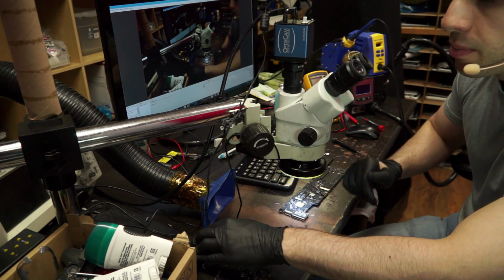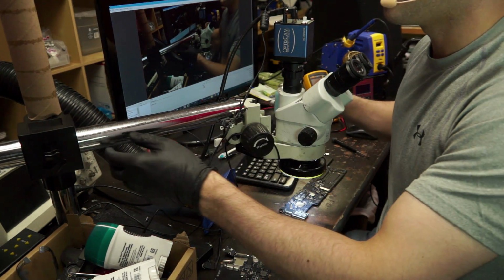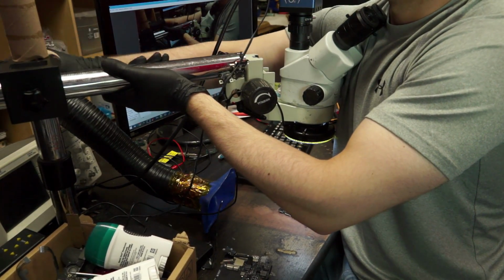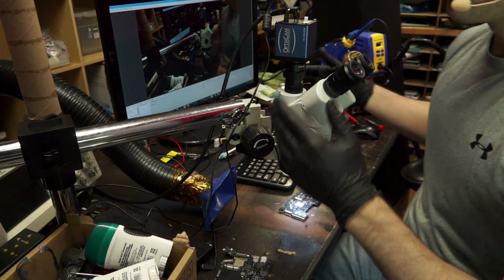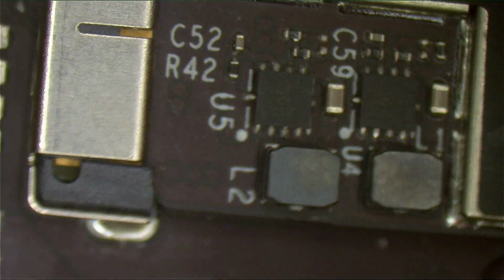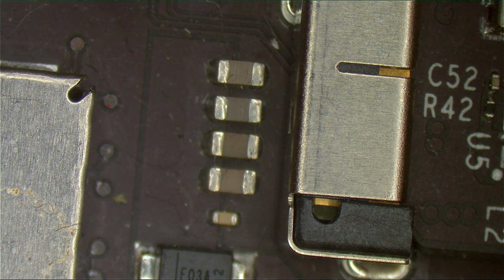The downside of the boom stand is that you lose the ability to easily go up and down. So again, if I want to move up and down on this, you've got to do this, and then you have to screw it in. And then if I want to go back down, I have to unscrew it and do this. So it's less convenient to move this around. But the upside is that it's stable. So if I want to walk across the room right now, let's get this in focus. If I just walk around the room, it's not going to go out of focus, which is nice.